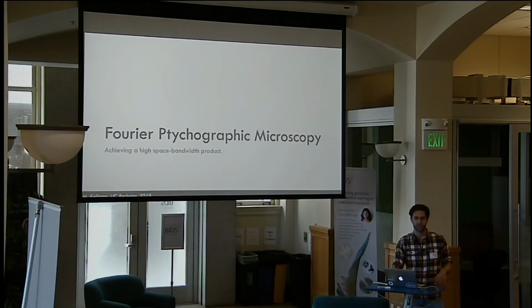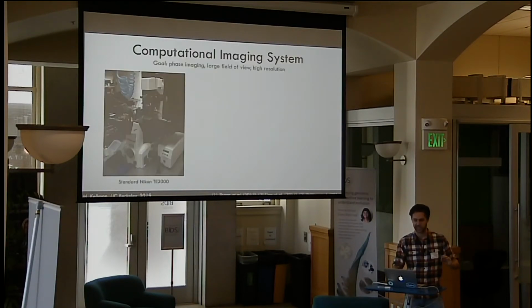So the method Fourier ptychography, I'll refer to it as FPM, Fourier ptychographic microscopy, is an existing method that is able to overcome these challenges, retrieving a sample's phase information as well as high spatial frequency information over a large field of view. And I'm going to just chat briefly about some of its implementation details and limitations.